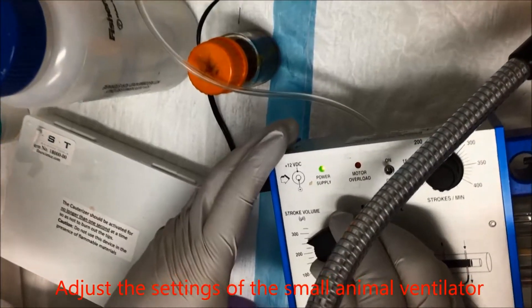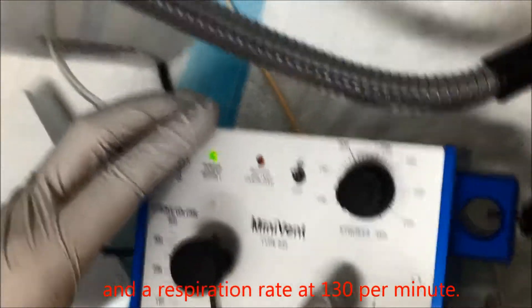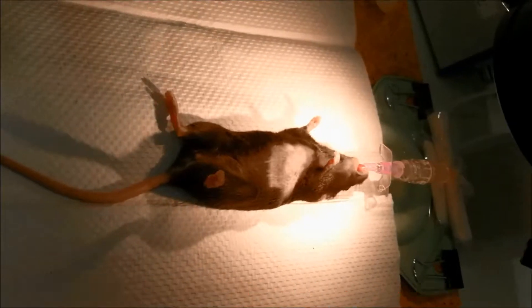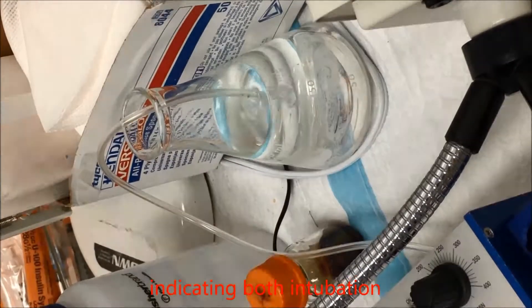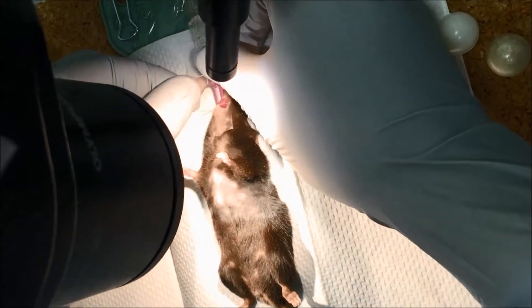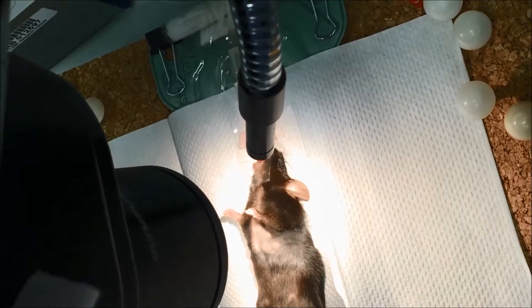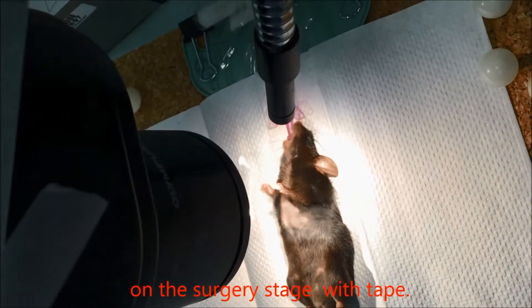Adjust the settings of the small animal ventilator to a tidal volume of around 10 microliter per gram of body weight and a respiration rate of 130 per minute. Put the mouse on the surgical stage and connect the cannula with the animal ventilator. Put the outlet of the ventilator tube into water — upward-floating air bubbles indicate both intubation and cannula connection are successful. Fix the mouse chin with the cannula using tape, fix the ventilator tube with tape, then move the outlet from the water and fix the mouse front and back feet on the surgery stage with tape.